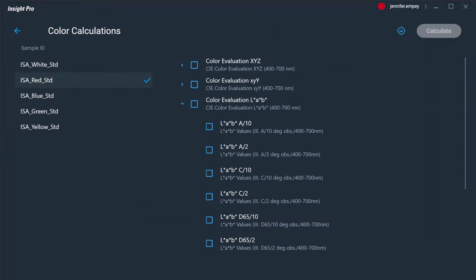The color calculation functionality within the math drop-down menu features a variety of color calculations, including the ability to determine CIE, LAB, and Tristimulus values, eliminating the need to use a secondary color analysis software or perform manual calculations.